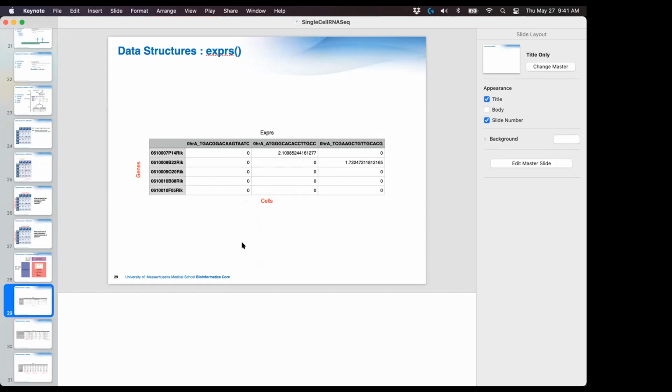Maybe you can also tell that in 10x, for example, the best chemistry you can use can cover only 30% of the transcripts in a single cell. I think 30 is even a bit high. Probably around 10 to 20% in their latest chemistry, but the published data mostly covers 10 to 20%. In Drop-seq it's 8 to 10%, I guess.